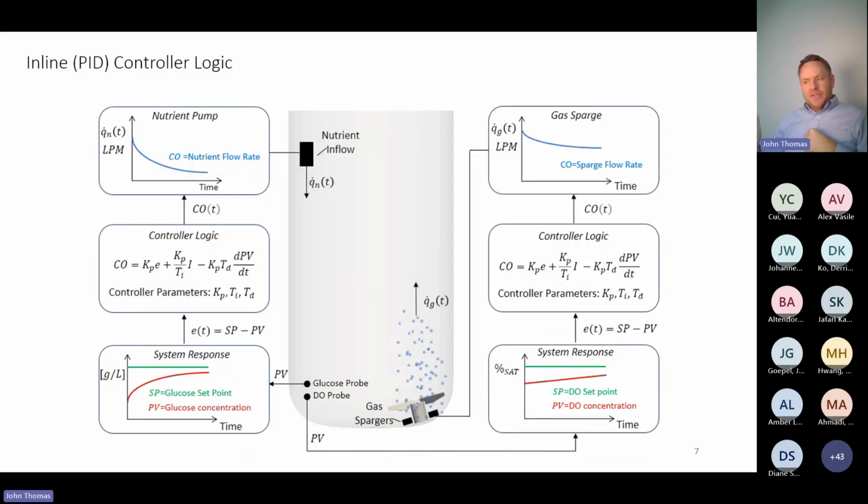An important part of this logic, and this goes down that daisy chain, remember: operating conditions, reactor topology, and this inline controller logic. This is a key feature of bioreactors and the simulation I'm trying to build. In fact, I would say the simulations would be incomplete if they didn't have this coupled physics inside of them.